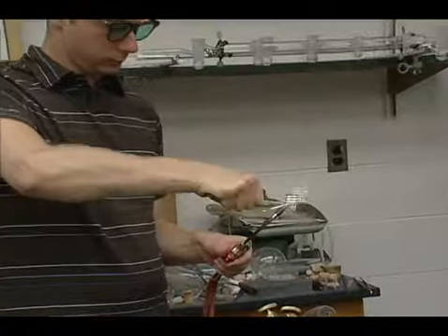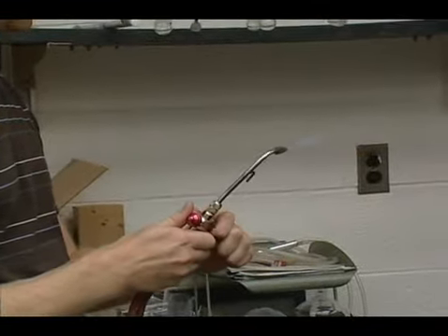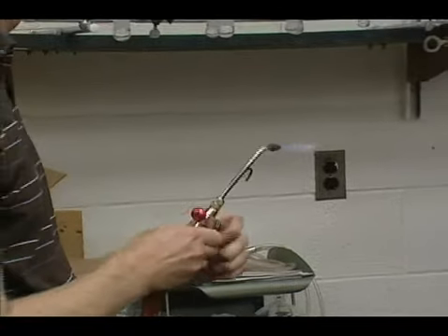So Matt, what is a scientific glassblower? Scientific glassblowing is sort of a broad field. For the most part, we work with researchers, at MSU primarily with graduate students and professors, to make custom pieces for laboratory use. We make stuff, and we also do repairs for the professors and graduate students, as well as the laboratory classes at MSU.